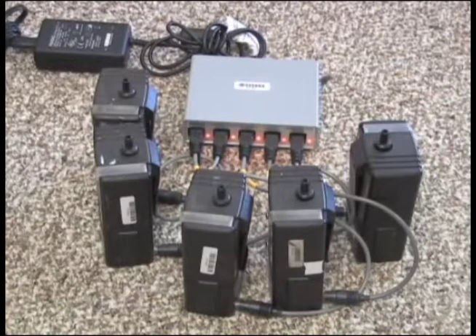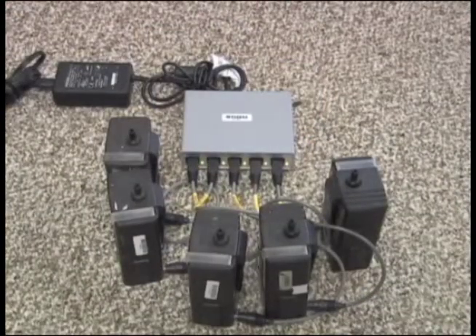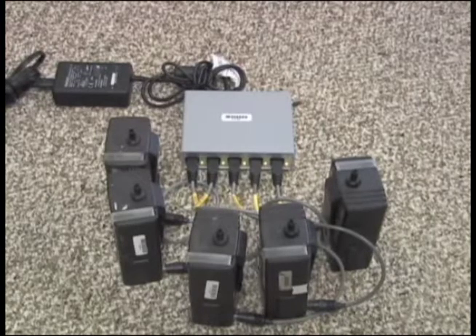When using the five station power flex charger, the light near each port will illuminate red when plugged in. Adjust the connections as needed until the lights illuminate. These lights will change to green when the battery is fully charged and will remain in trickle charge mode until unplugged.